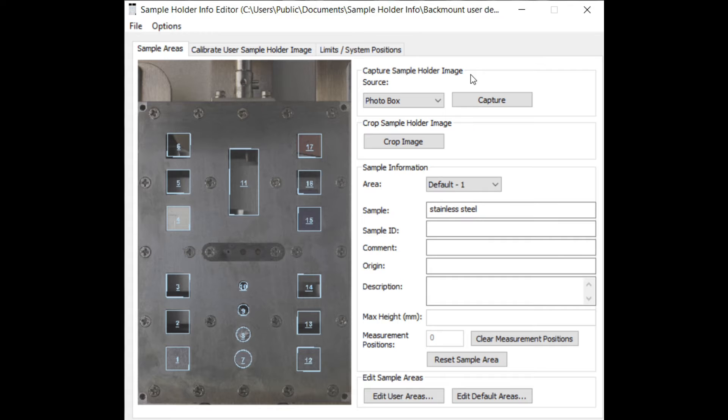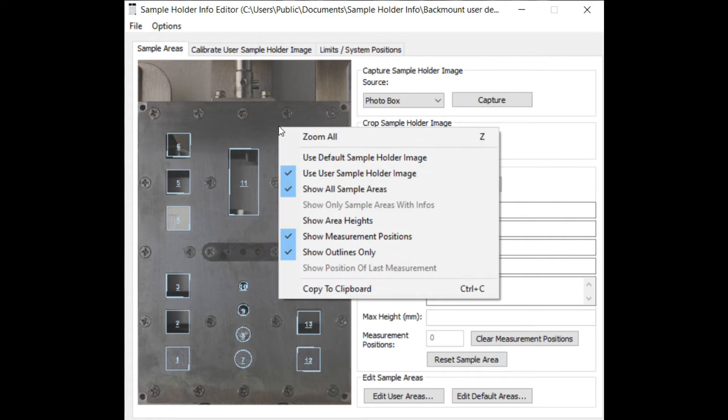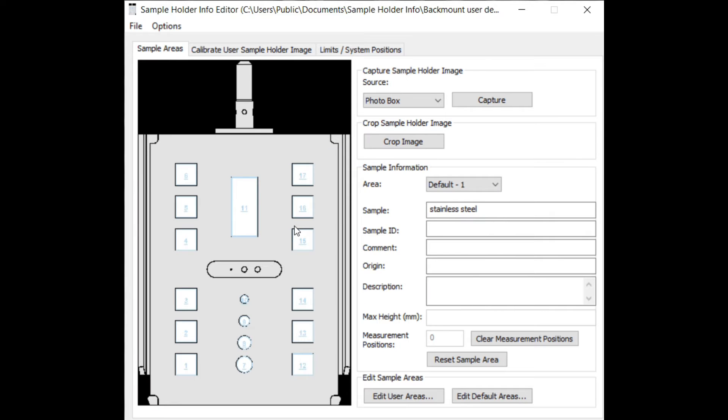If you have a photo box, capture a picture of your sample holder. If you don't have a photo box, you will see the default image in the dialog.